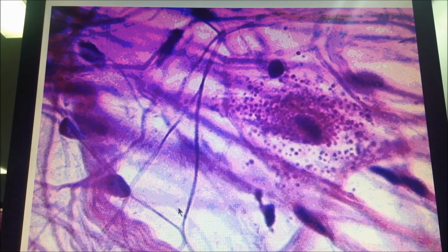Once again, here the zoom is high. What do you want here, the cell here? What type of cell is that? Also a mast cell. Rounded nucleus with a huge amount of granules. Basophilic granules in the cytoplasm. In theory, the granules of the mast cell stain basophilic.